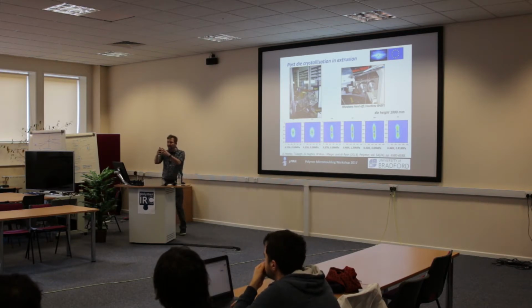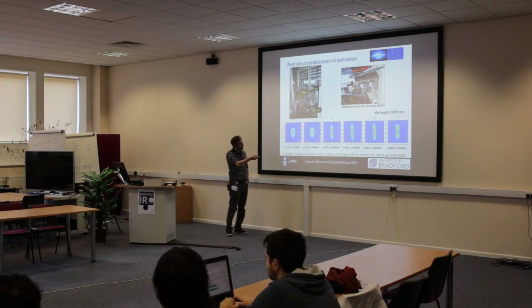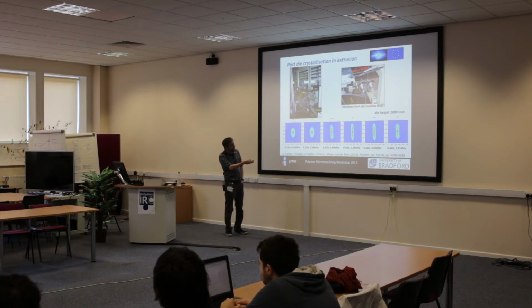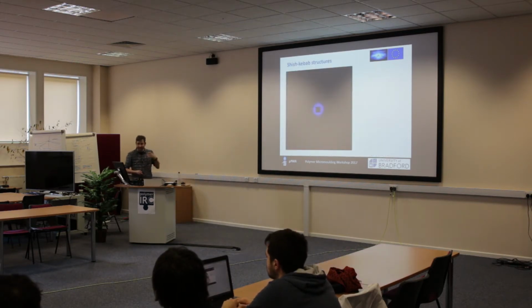As I said yesterday, you start to stretch these materials, and that's why they shear thin in the viscosity curves. So you're actually orienting your materials. Instead of getting a nice isotropic scattering pattern, we don't. We see nothing out here. These are just at different haul-off rates. All of your orientation is in the draw direction. And that infers, again, quite a massive change.